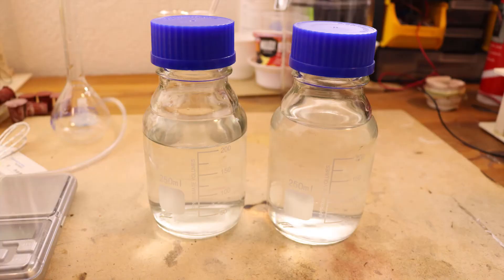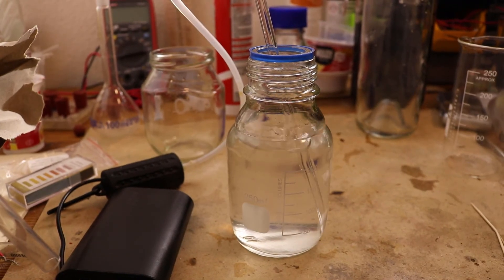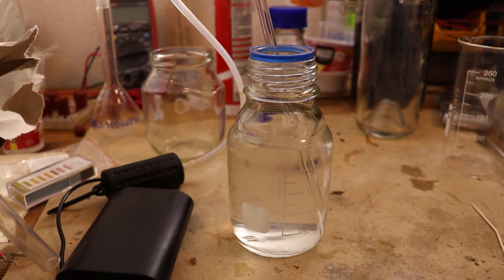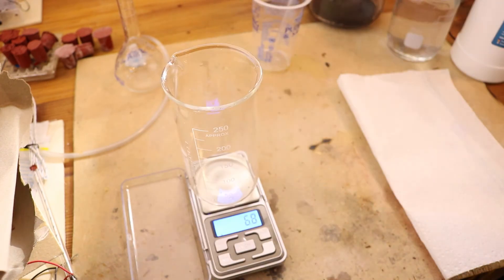So now we only have sulfurous acid, not sulfuric acid. The German Wikipedia says you can turn sulfurous acid H₂SO₃ into sulfuric acid H₂SO₄ by using air — funny enough the English version doesn't say that. And after bubbling in some air I saw why it can't really work: sulfurous acid is just an equilibrium reaction between the water and the sulfur dioxide gas, and when air is bubbled through it the gas leaves the solution. So I need a better way, and that is hydrogen peroxide.